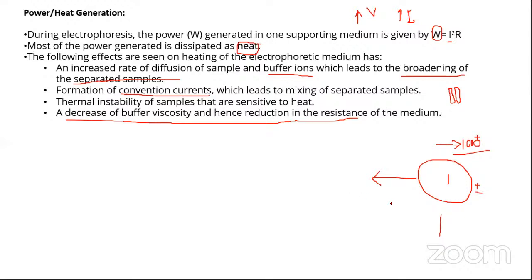So, will there be a good separation according to you? In all this situation, do you feel that there will be a good separation or there will be a bad separation? Yes, anybody? Have I complicated things for you more? Do you feel that there will be good separation now? Anybody? If you just increase the voltage.